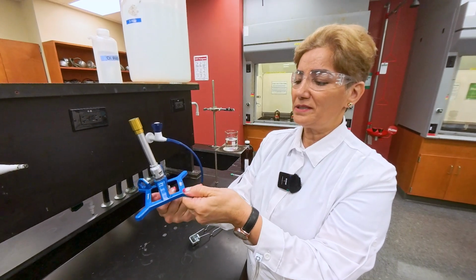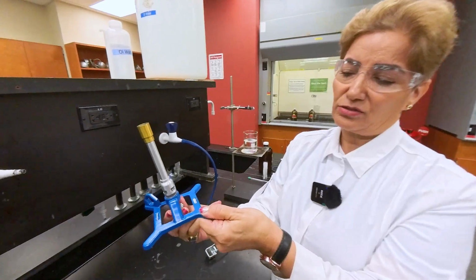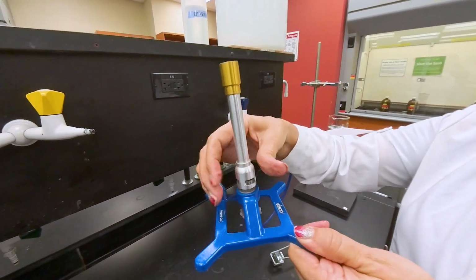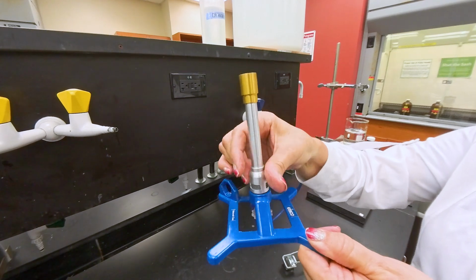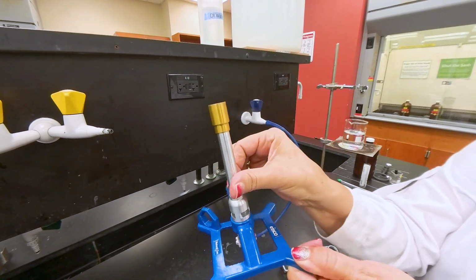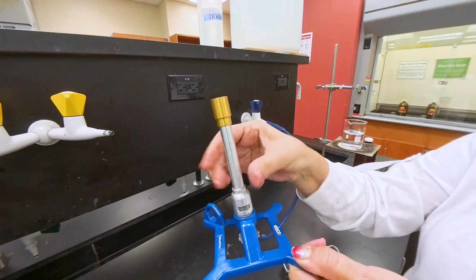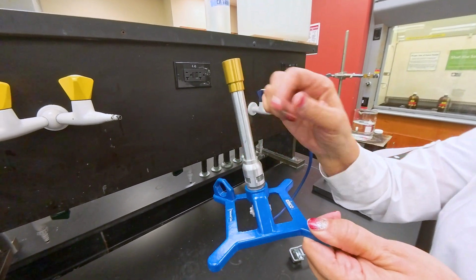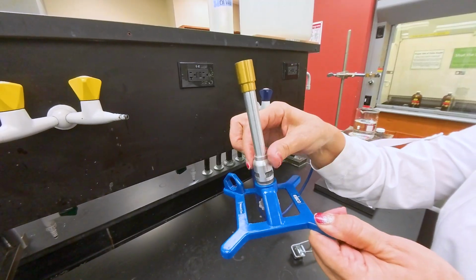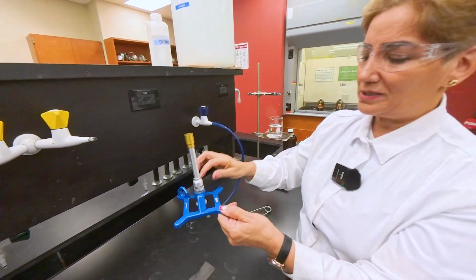If you want to open it, you turn it to the left side like 2-3 times. I usually do 3 rounds. With the design of this Bunsen burner, when it's all the way closed, I usually open 3 full rounds, but I just tested this, and it required a little bit more, maybe 4 or 5 full rounds, to make sure I have enough oxygen mixing in.